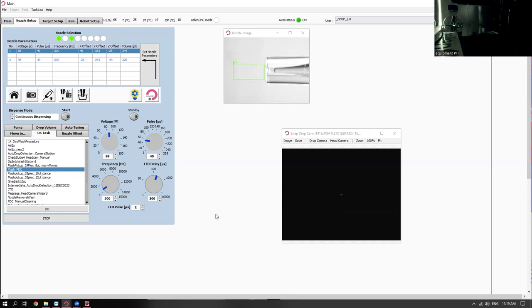Okay. And is there a way that with our eyes we can differentiate these different states in transmission? Certainly in fluorescence, we probably would.